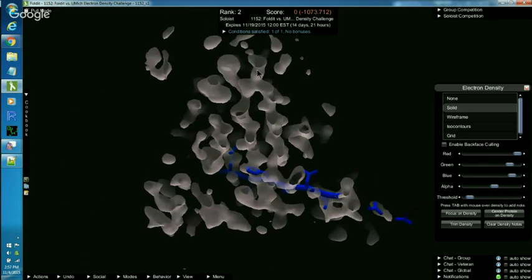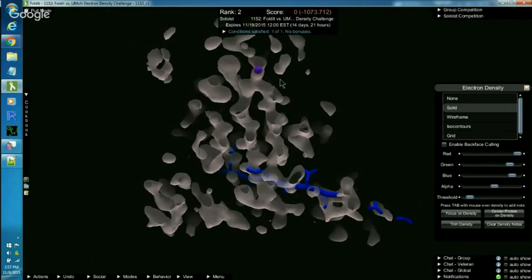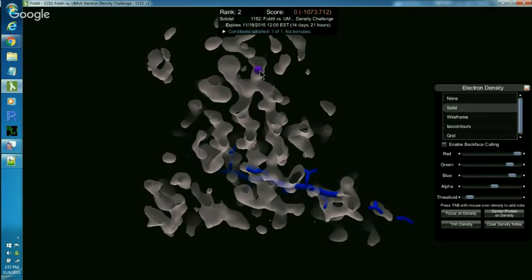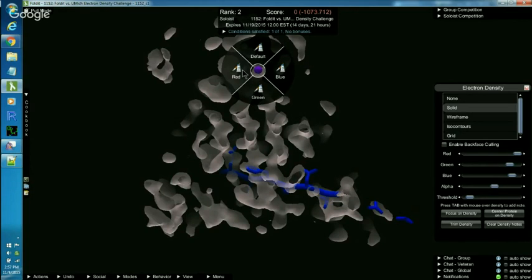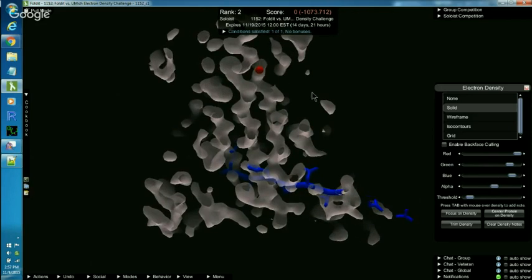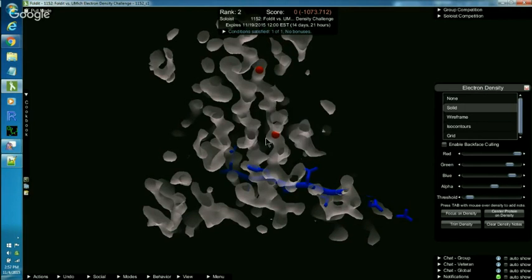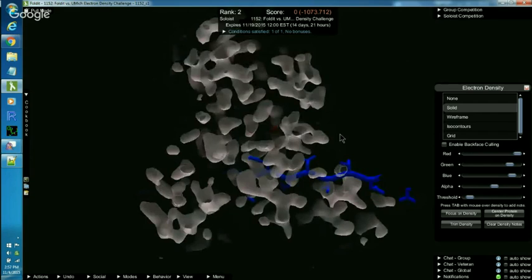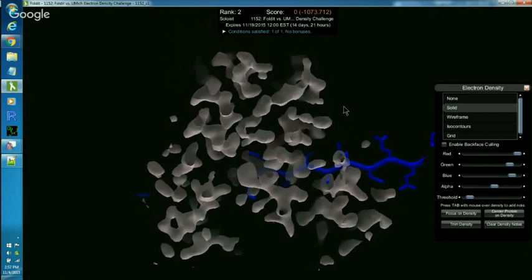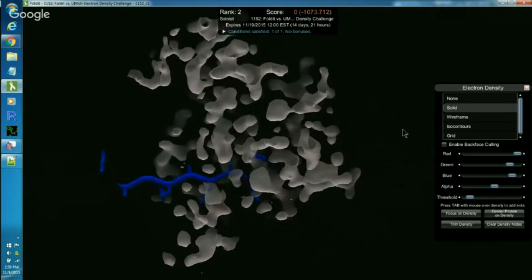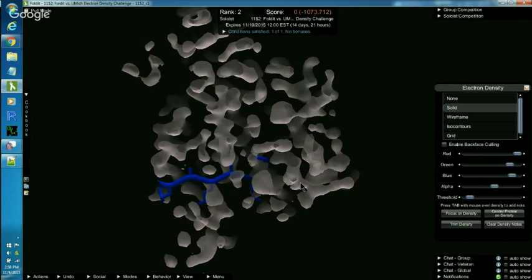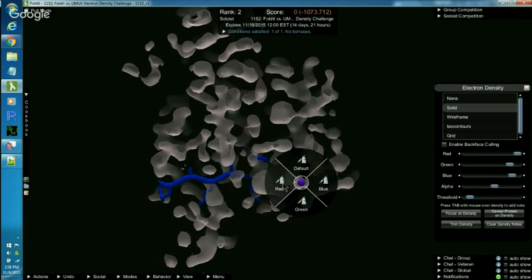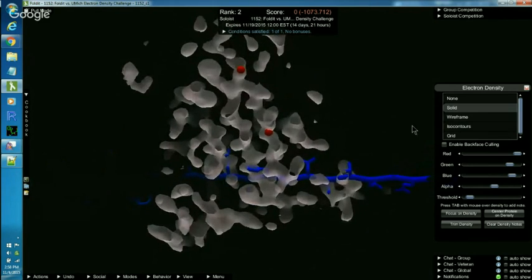It looks like this one starts up here. I'm going to put a dot here. I put my mouse on the cloud. I hit tab to place a dot. You can't actually see the dot because I cut away the foreground. Let me slide that back a little bit. Now, the dot is visible. And I use red. So, I'm going to change the color. Put my mouse on the dot, right click, and I can choose a new color for the dot. I like to use red for sheets. So, there's one end of the sheet. This is quite a long sheet. So, I'm going to mark the middle as well. And how far down does that go? So, it looks like it continues to about here. So, I'm going to put a final dot. That will be my first sheet marked.